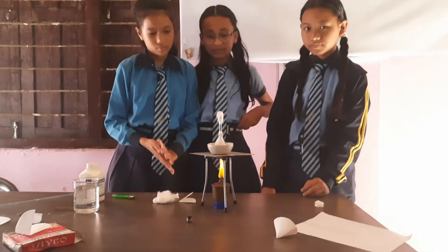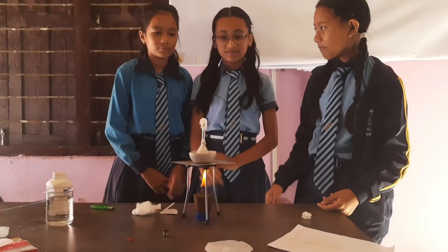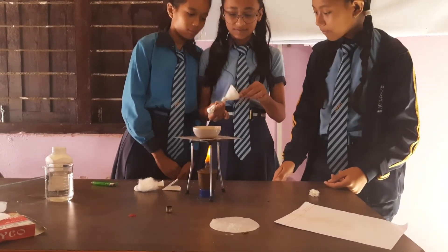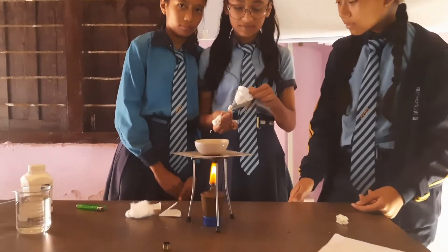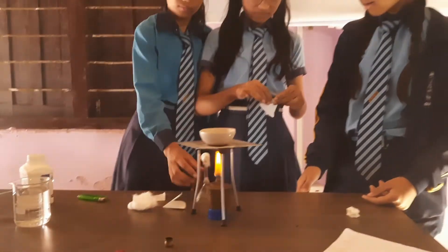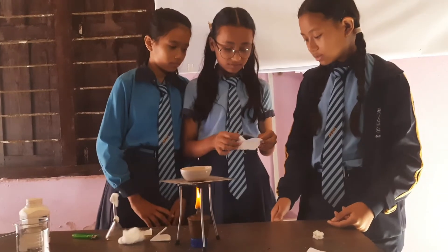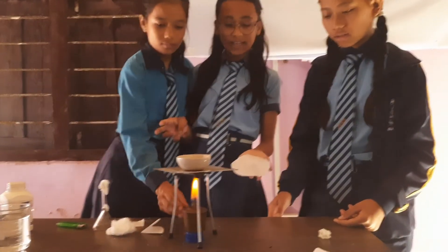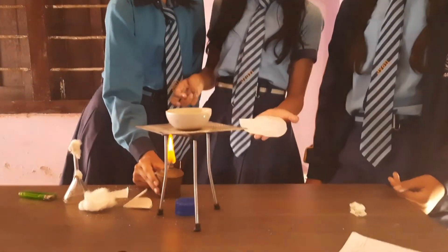That will be enough. The camphor is deposited — the camphor is stored here.